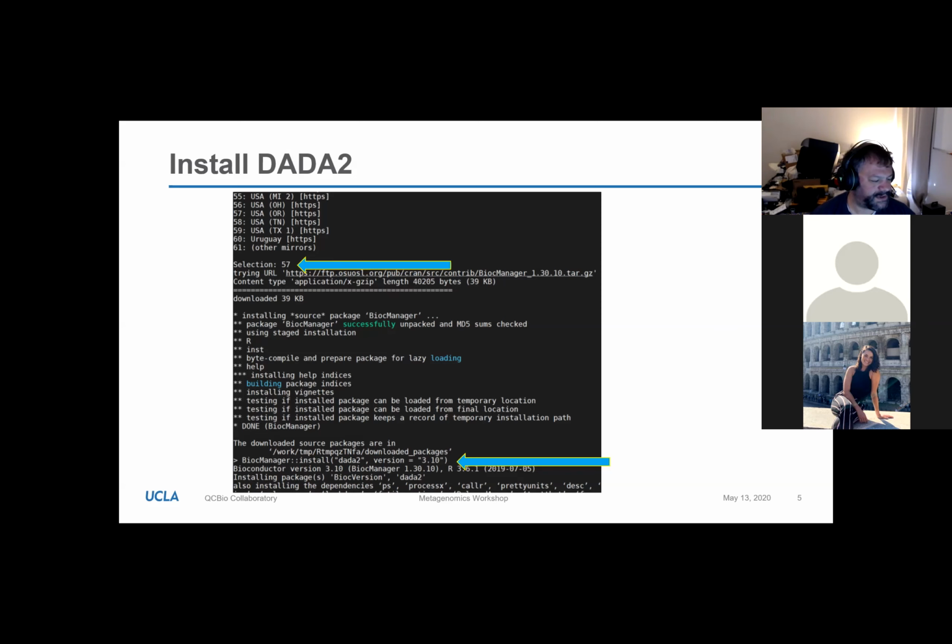All right, so I'll give Yajing a minute or two to get that sorted out, but that should be easy to fix. You just remember also that the up arrow works in R. So if you typed in a command and that command had a little bit of a mistake in it, or you're going to type in a command that's extremely similar to it, if you hit the up arrow, you'll get back your previous command in an editable form.